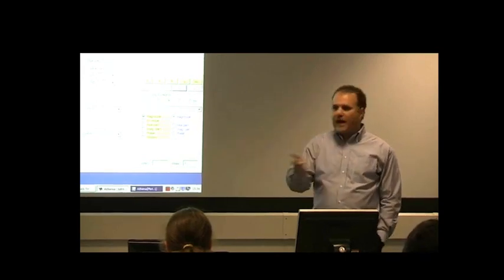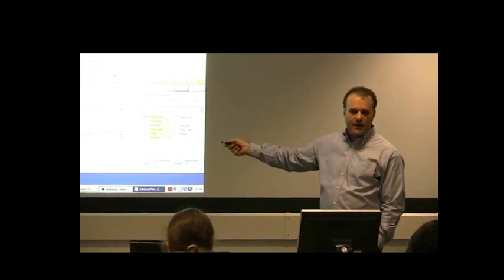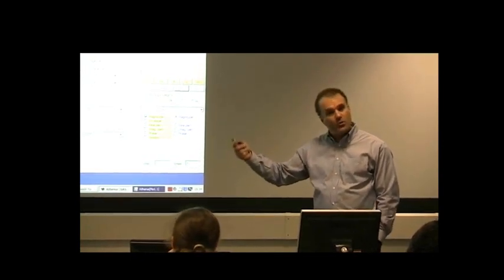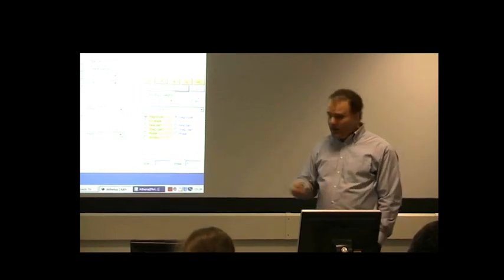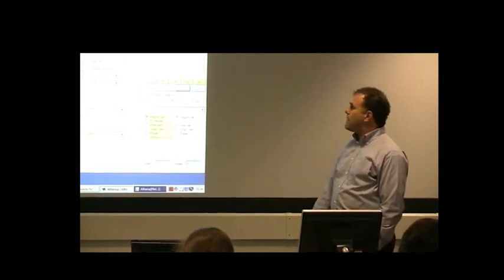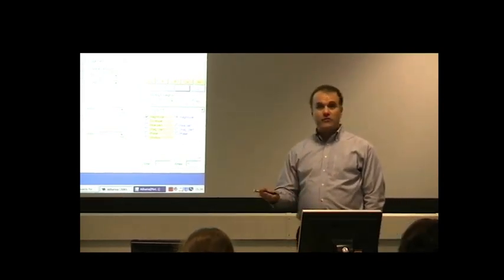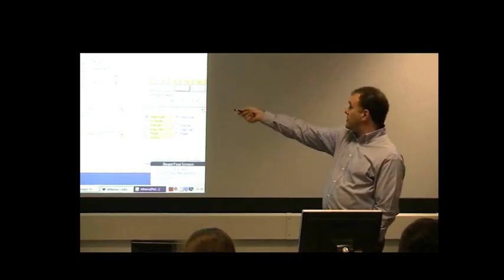There are some set of parameters that you're going to use to describe this first peak in the data, the things that we're going to learn about tomorrow when we start looking at Artemis. And clearly, if you were to analyze the blue and the red, you would come up with different values for coordination number, obviously, because the red one is so much smaller than the blue one.